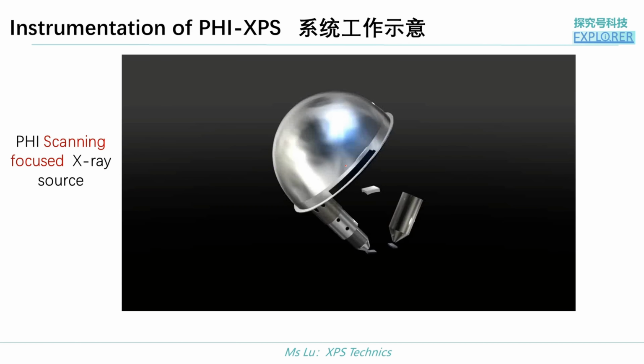As for PHI XPS, it uses a scanning focused X-ray beam. So how does the X-ray source come out? Let's take a look at the video.